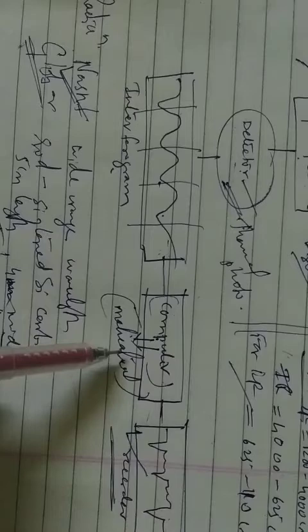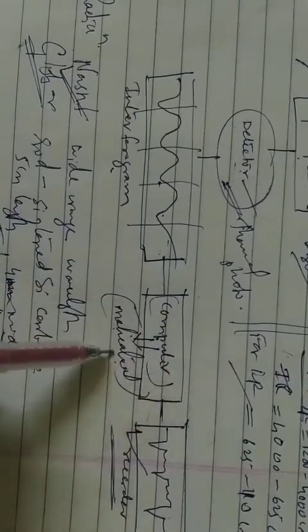And finally it is transformed, that's called Fourier transform, by the computerized system. And finally we get the normal spectra in this way, as we see.